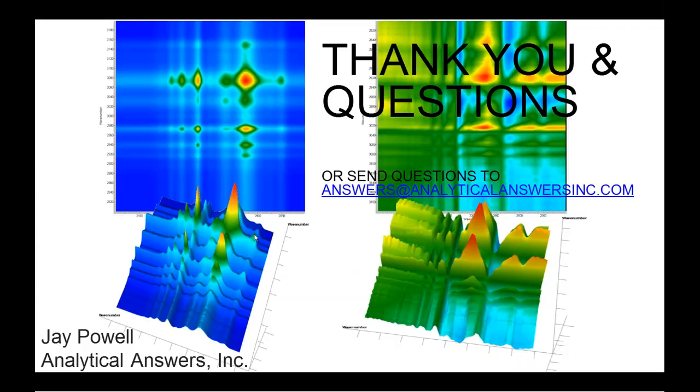Quantitative actually gets a little bit outside infrared. A very simple way of doing quantitative analysis of non-volatile residues from the solvent cleaners is simple gravimetric analysis. We take a fixed volume of the solvent, evaporate it in a pre-weighed vessel, and just weigh the residue. Solvent-based cleaners may also have other volatile compounds in there, so we also have the capability of doing gas chromatography or GC or combined GC-IR as well, although typically a volatile solvent in a solvent cleaner is less of a concern unless it starts to affect seals and gaskets and the like.